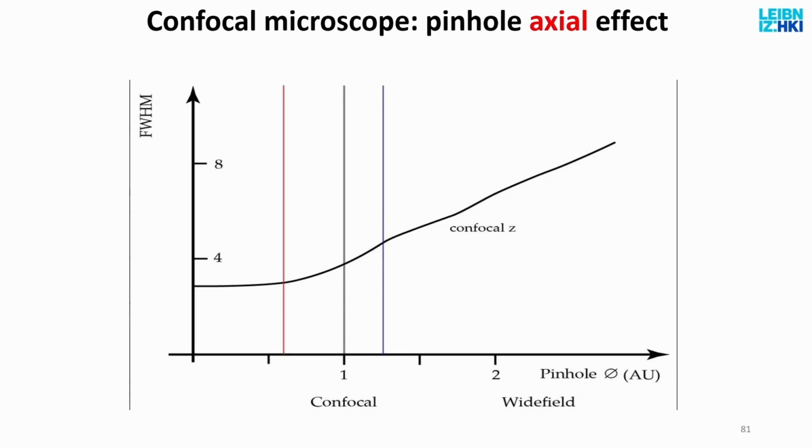So, optimal as a rule of thumb, we set the pinhole size to 1 Airy unit. But if I open the pinhole, I get less confocality. Should I close the pinhole? And these curves show you what you should do. This is the axial resolution. Full width, half max, doesn't matter. The smaller the number, the better the resolution.